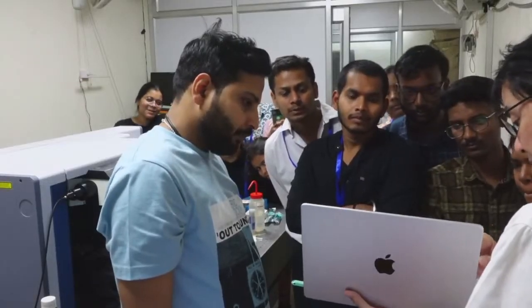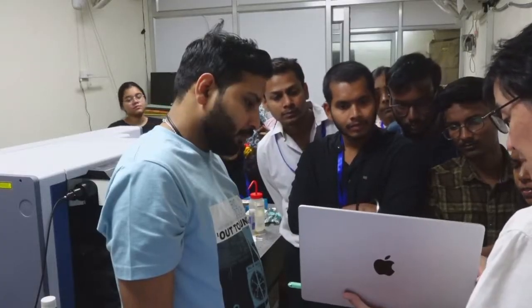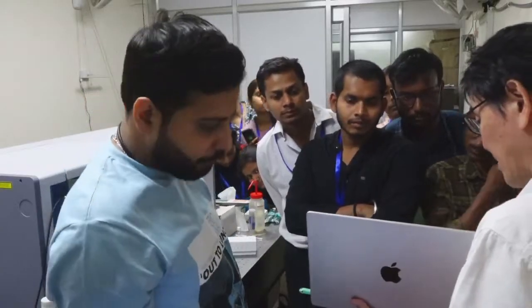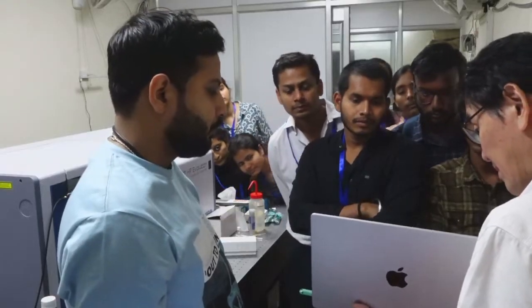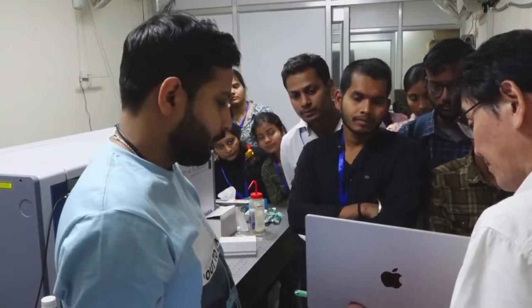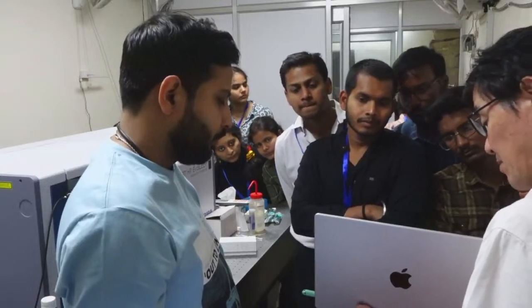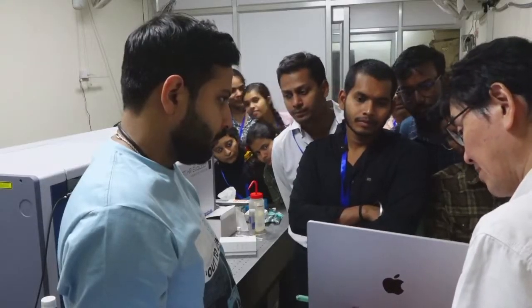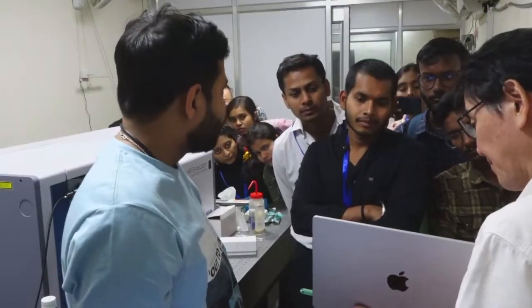Yesterday we found in the fructose spectrum that CH stretching appears below 3000, and the corresponding peak appears here below 3000. That is CH stretching. As well as this peak, we find many peaks below 1500. Blue is the sucrose spectrum. The SN ratio is a little bit not good, but anyway, we see the intensity pattern is different, and the peak positions are quite different.